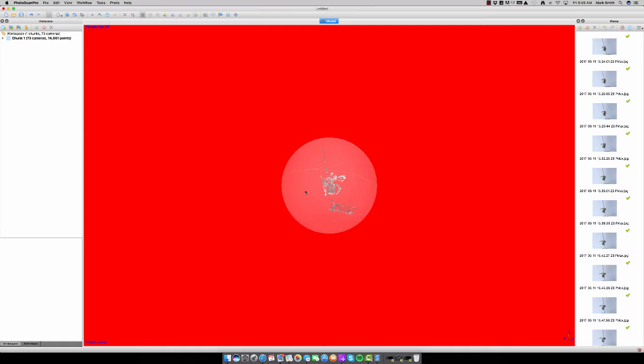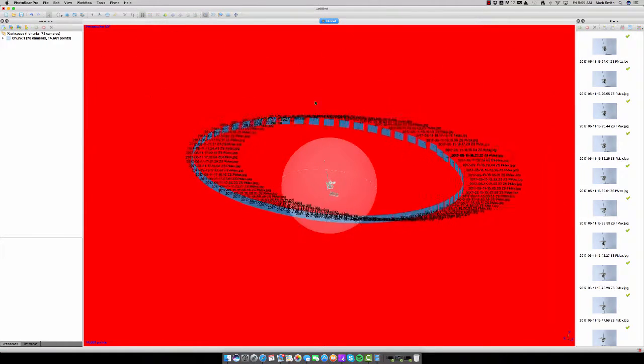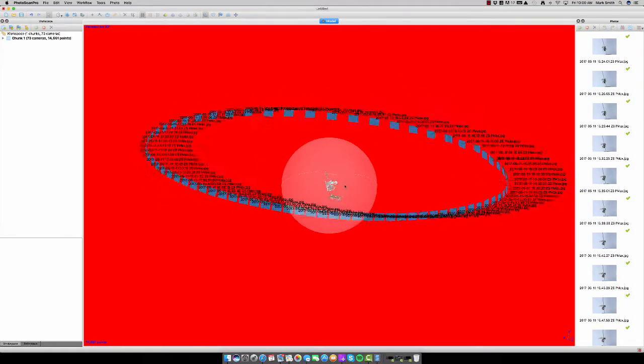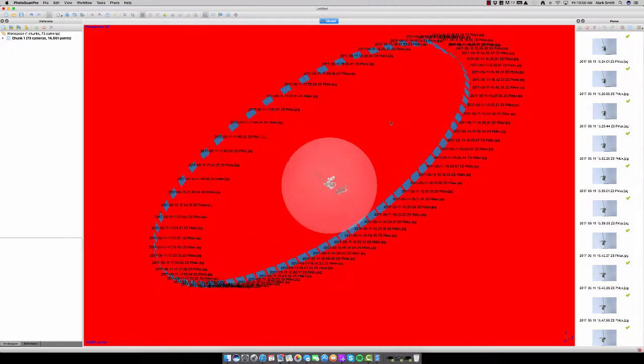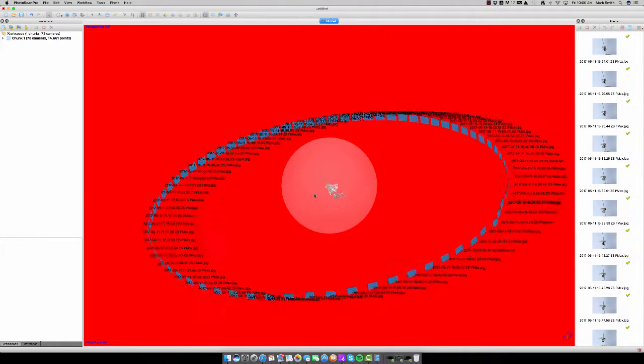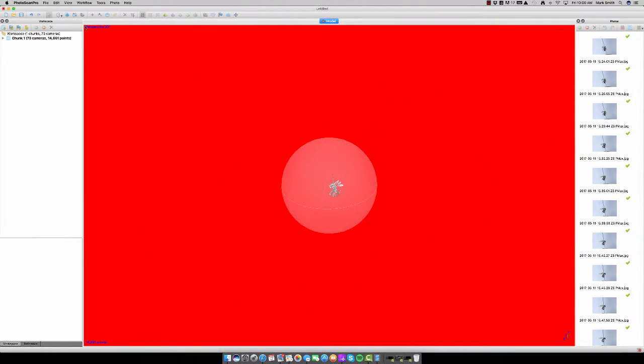Okay. So now we're back. I think that this is pretty clean for proceeding to the next step and phase of the workflow. One thing that I want to just point out real quick is that if you were to zoom out of this, and let's say you weren't confident on the alignment, this one came together really well. But let's say you weren't confident, you could check the alignment of the photos that we captured by clicking that camera function. So this shows where we captured each picture, and it'll set it up in the pattern at which we captured. And you can see here that these photos are perfectly aligned in a 360-degree sphere in approximately 5-degree intervals, which is exactly what we want when reconstructing a 3D model. So that's perfect.